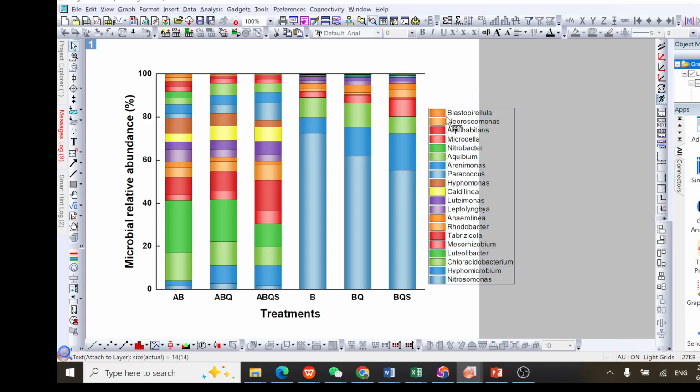Yeah. So what are you going to do next? We have to separate this microalgae bacterial bioreactor. Why is this one only bacterial bioreactor? So we separate it. How are you going to do that? You come to this place.